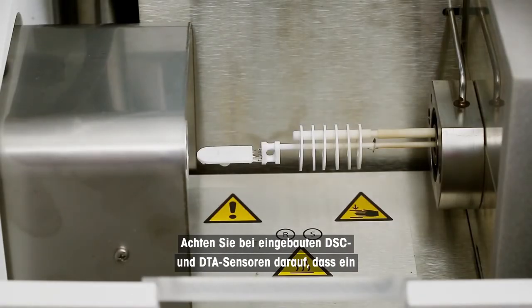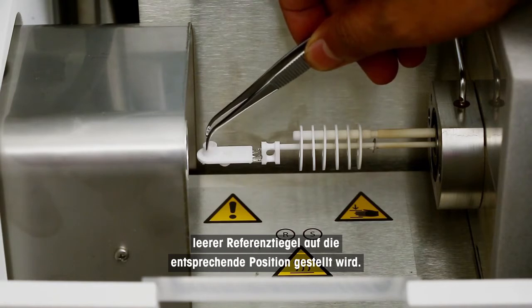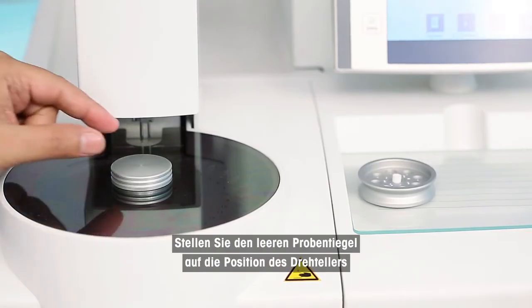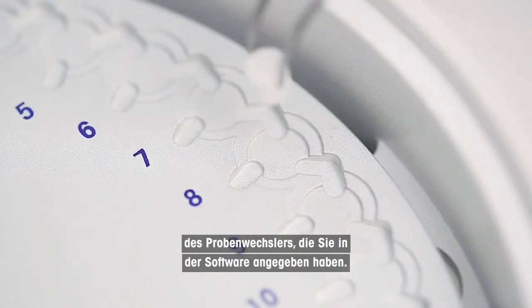For built-in DSC and DTA sensors, make sure that an empty reference crucible is placed on the respective position. Place the empty sample crucible on the position of the robot turntable you specified in the software.